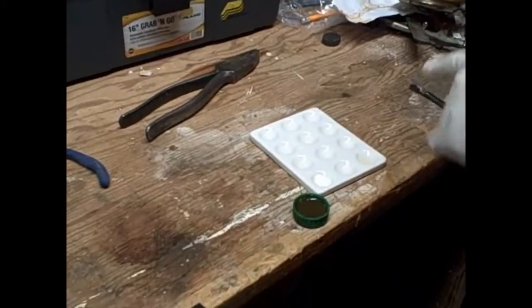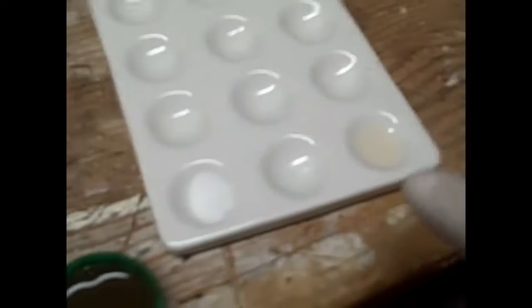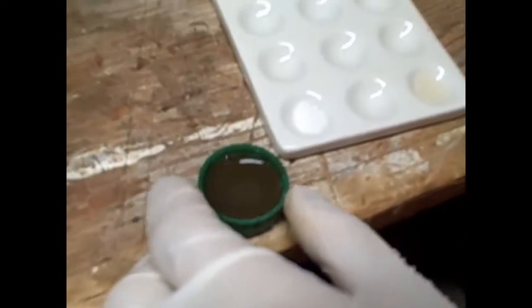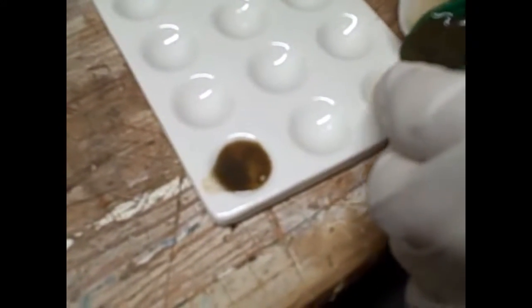Alright, so we have a spot plate with some washing soda — basically baking soda but a little bit different — and then we have some vinegar as an acid. So we have base and acid. Let's pour that in. No reaction. Add the acid. You spilled a little bit there.